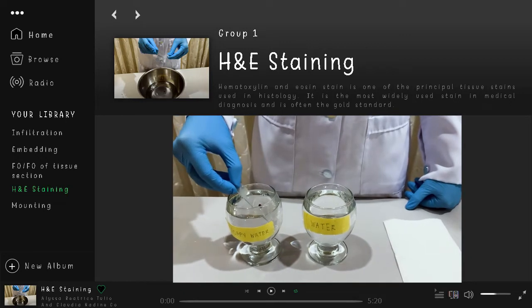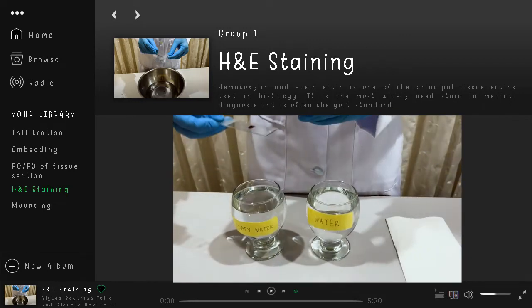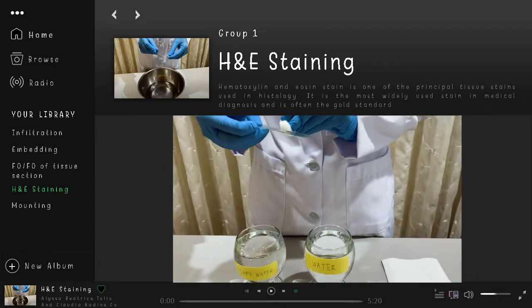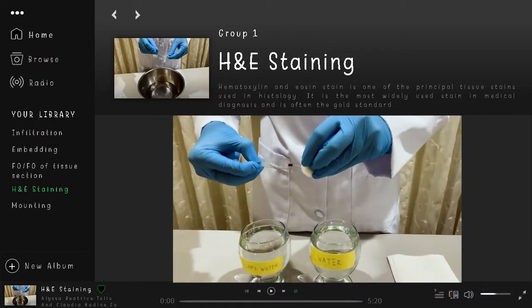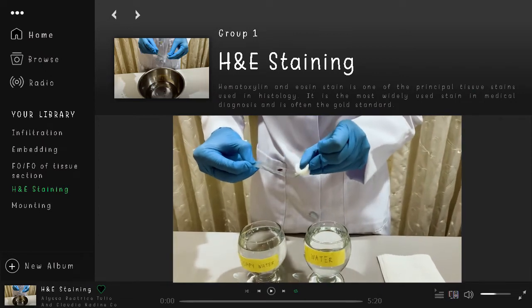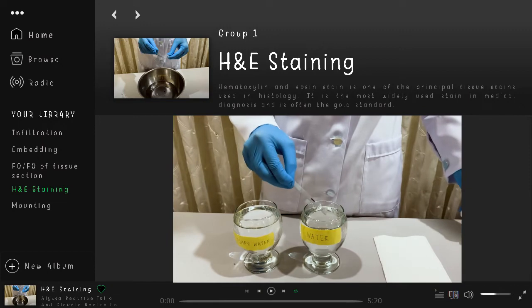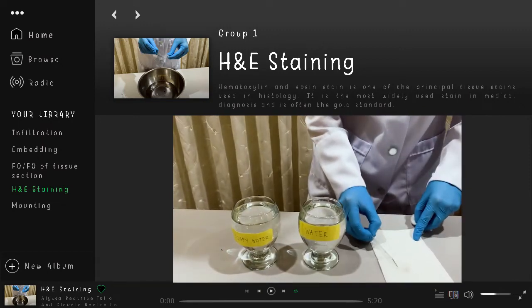Wash slides in soapy water and remove excess albumin or impurities using a cotton swab. Make sure to not touch the tissue sections. Then we rinse the slide well with clean water and drain excess water on paper towels.